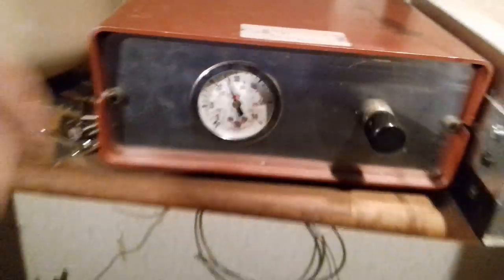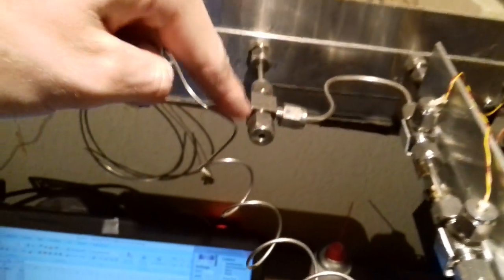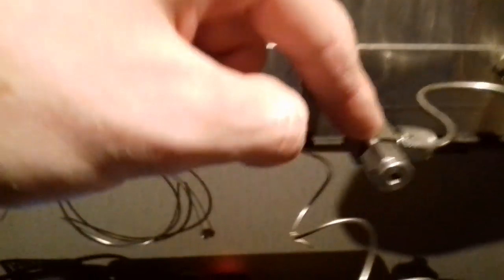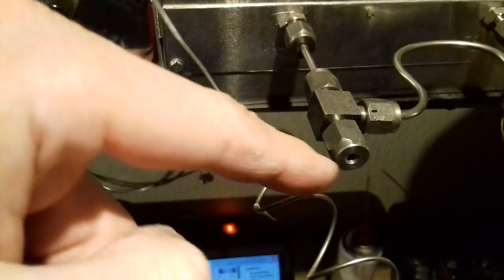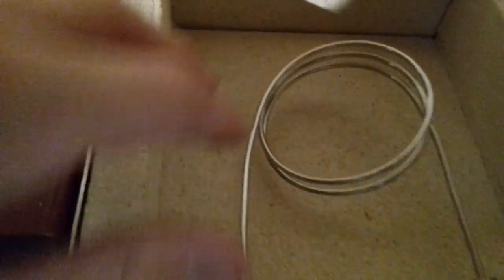That then runs through the reference side of my detector and into the inlet. The inlet is just a T-fitting with a rubber disc called a septum, which runs into the oven through these bulkhead connectors.